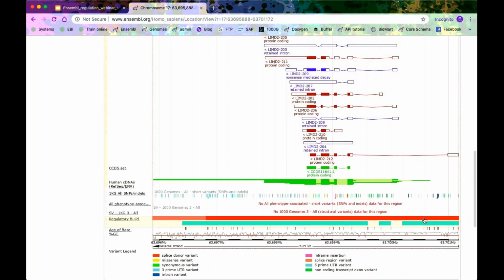It actually covers the gene. And it's quite an interesting thing that we've discovered, that we can see epigenomic activity related to the activity of the gene in the promoters frequently spanning the gene itself and sometimes the neighboring genes. So I know it's a promoter because I know the color codes because I work with it all the time.